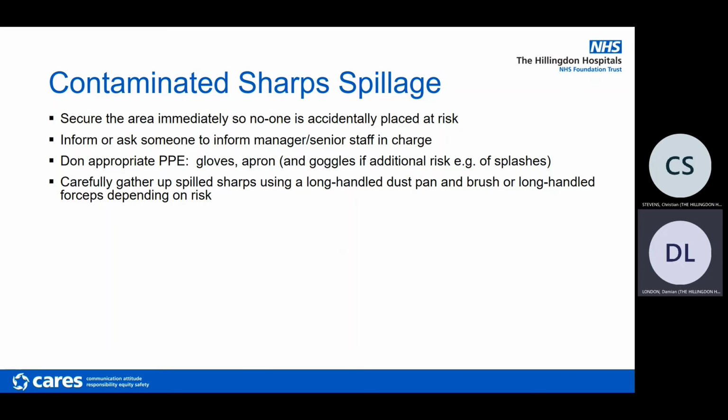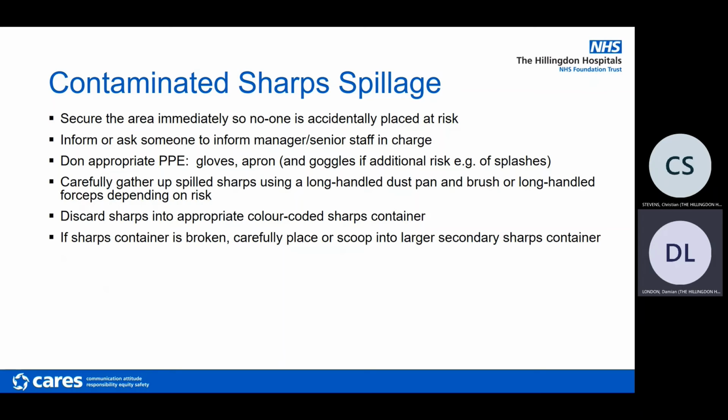Carefully gather up the spilled sharps using a long-handled dustpan and brush, or long-handled forceps, depending on risk. If there are only a few pieces of sharps, forceps might be applicable. If there are a lot, then the other option might be needed. Discard into an appropriately color-coded container.